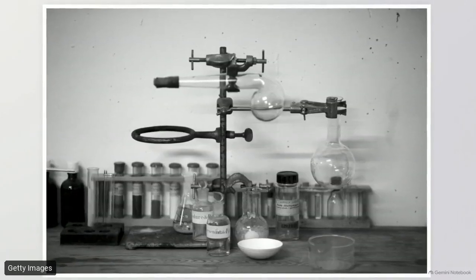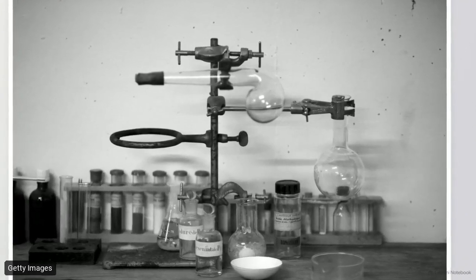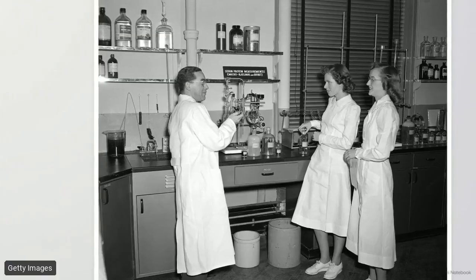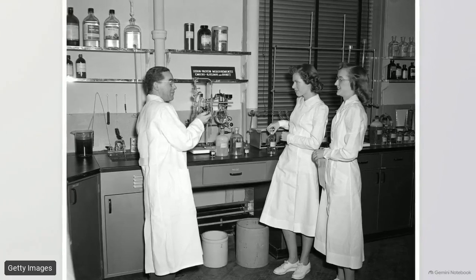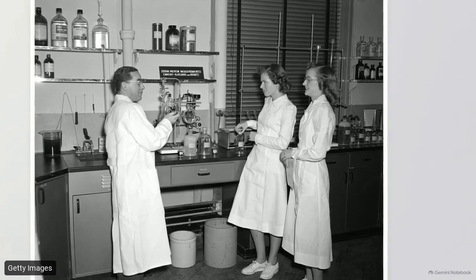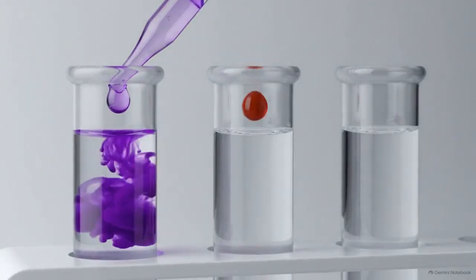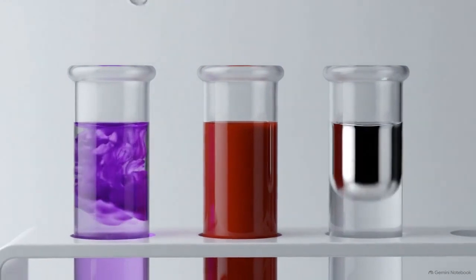These abstract benchtop reactions solved real-world medical problems. They provided the practical evidence needed to build modern clinical diagnosis and nutritional science. Long before modern electronic sensors, testing for reducing sugars was the earliest reliable method for doctors to detect glucose in the urine of diabetic patients. By exploiting these molecular weaknesses, chemistry lets us see what the eye cannot, translating microscopic structures into a series of predictable, visible signals.